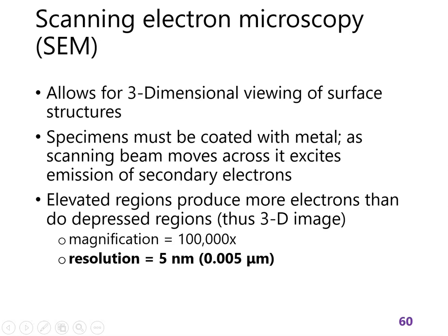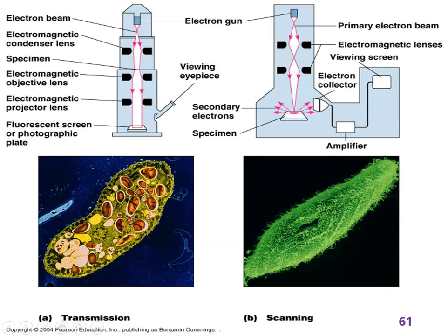but not quite as good as what you get from transmission electron microscopy. And these are two false colored pictures of a large eukaryotic organism, like a paramecium or something. This is not a bacterium. This is much bigger than bacteria. Scanning electron microscopy lets you see surface features like the little hairs on the outside of this thing. Transmission electron microscopy lets you look at a cross-section and you can see internal structures. And they've gone in and colored the structures either yellow or white or red.